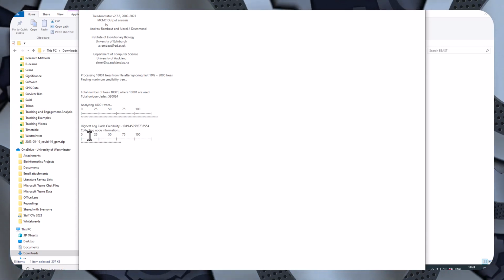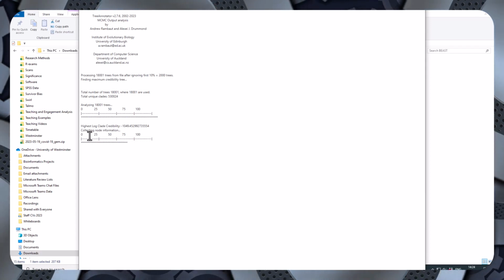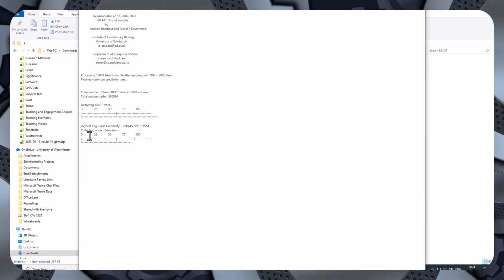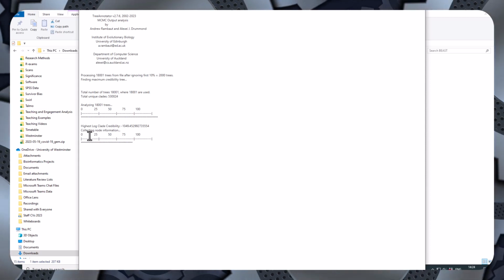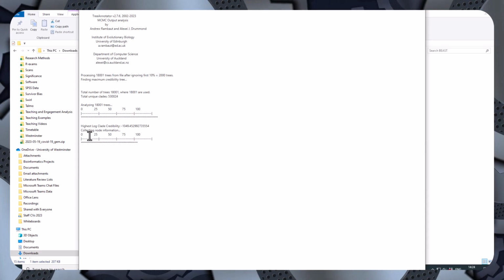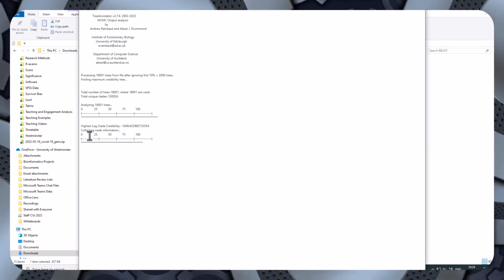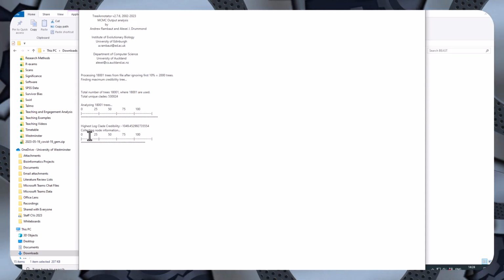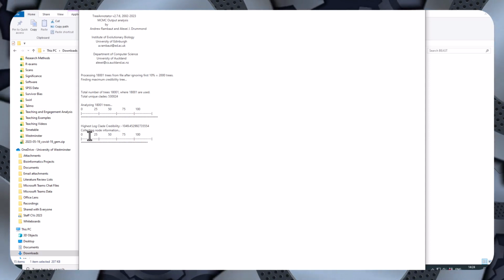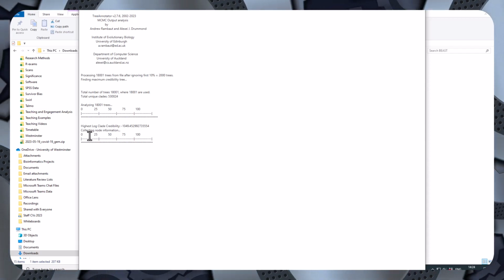Done the second stage. So it's now doing the annotations of the tree. Once it gets to the end of this, I can just close down this. Okay, it's finished. So it doesn't stop the program automatically. You just have to close it and drop out of it. So now I've got the tree created, the merged together tree. I can use FigTree to view it.